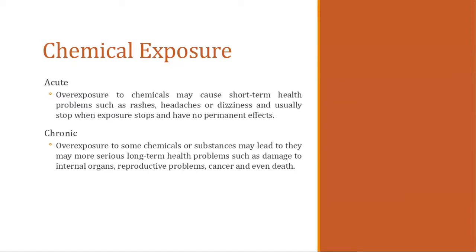But then you have chemicals that, over longer periods of time, or some chemicals are just that dangerous that small amounts of overexposure can lead to serious, more long-term health problems, where it damages your internal organs, causes reproductive issues, cancer, and even death.